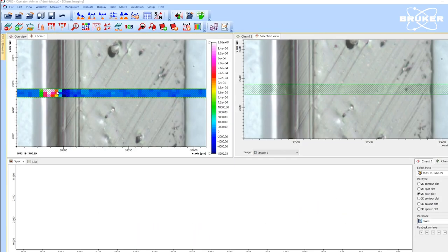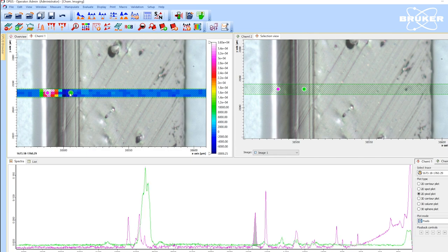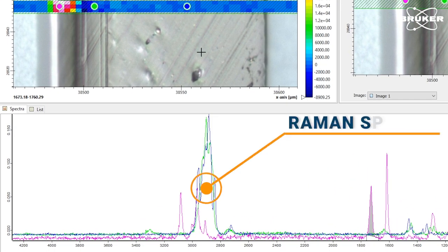After a few minutes, we receive the final results. We can now start to identify the individual layers by their unique Raman spectral signature.